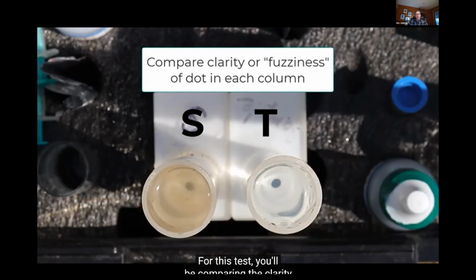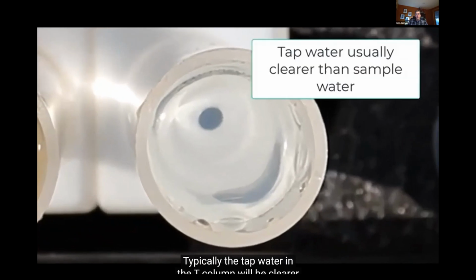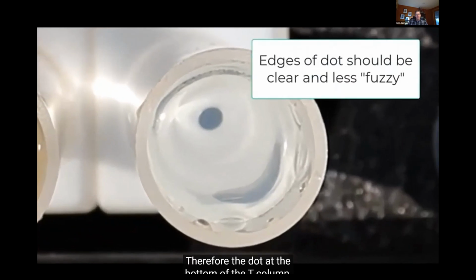For this test, you will be comparing the clarity or the fuzziness of the black dots in the bottom of the 2 columns. Do not consider the color of the water. Typically, the tap water in the T column will be clearer than the sample water. Therefore, the dot at the bottom of the T column will appear clearer, sharper, with less fuzziness.